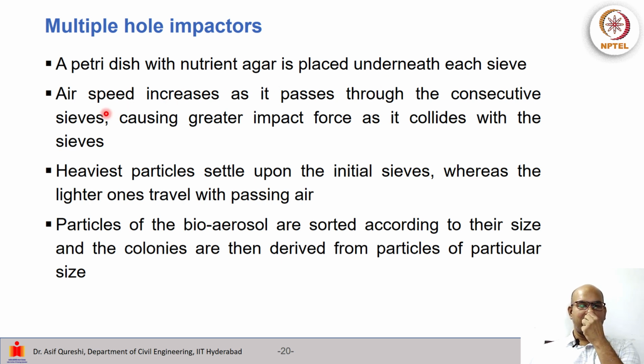Now, as the air is passed through the consecutive sieves, the air speed increases, and it leads to a greater impact force when it collides with the sieves. Now the heaviest particles will settle on the initial sieve.